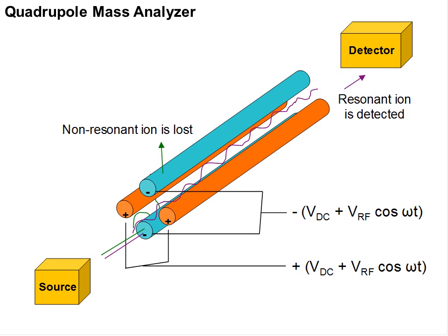For example, the frequency can go from high frequencies, which are appropriate for ions with low inertia, this means with low mass, to a slower frequency, which is more appropriate for heavy ions. As you can imagine, inertia plays an important role because the ions have to change their way of movement according to the frequency. Light ions can move fast because they have a low inertia. Big ions move slowly and thus require a longer resonant frequency. Modern quadrupole mass analyzers can scan very fast, certainly multiple scans per second.